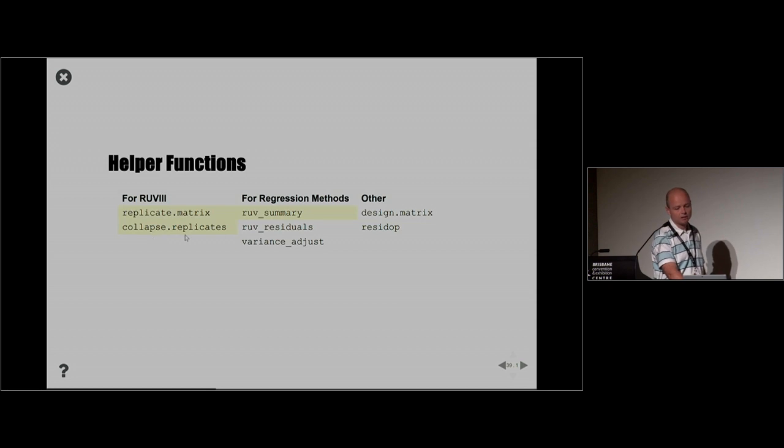I may or may not go into this, but basically it's for eventually after you've used your replicates to estimate the unwanted variation, you might not really have any use for them as replicates anymore, and you might just want to average over all of the replicates. So, if you have one from Davis, one from Michigan, one from Irvine, there might no longer be a point in keeping all of them as different arrays. You just want to average over all of them. If you do that, then you also want to, in some sense, average the metadata. This takes care of that.